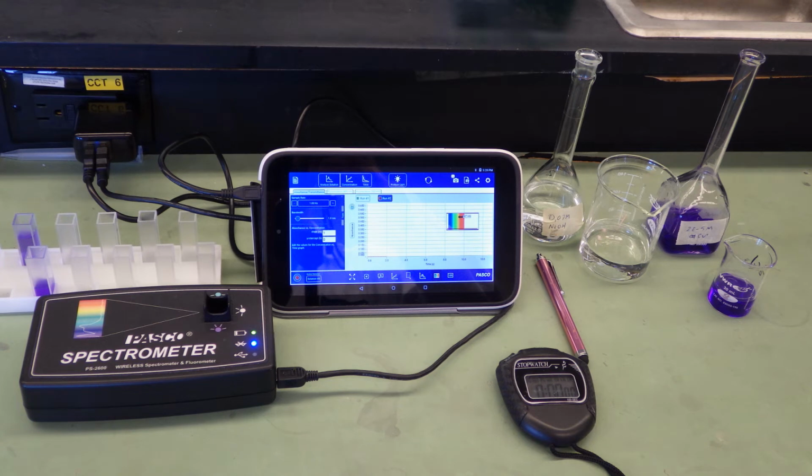Here is the equipment we'll be using. I'm using a Pasco PS2600 spectrometer and tablet. You'll need a solution of crystal violet of known concentration and sodium hydroxide of known concentration, and a stopwatch. We are using 1 centimeter plastic cuvettes.